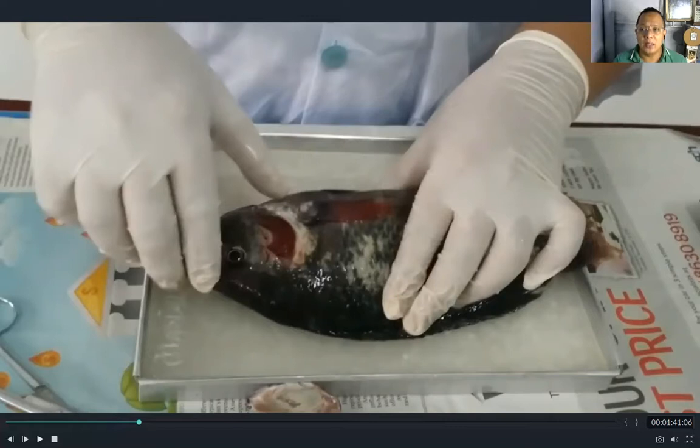When we do dissecting, we use a dissecting kit. But since we are not in school, we need to become resourceful. So at home, we use at least a scissor, cutter, or knife. Be sure that those instruments are sharp enough to cut the parts of the fish.